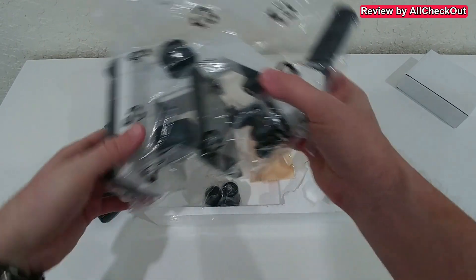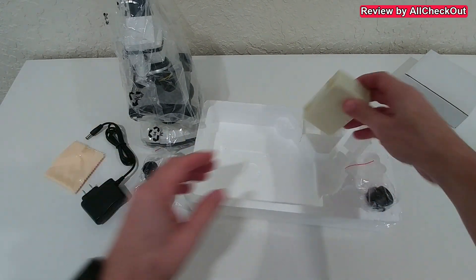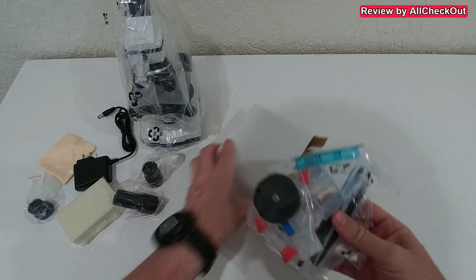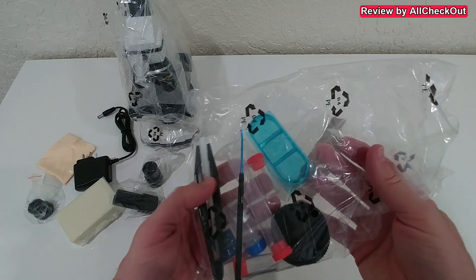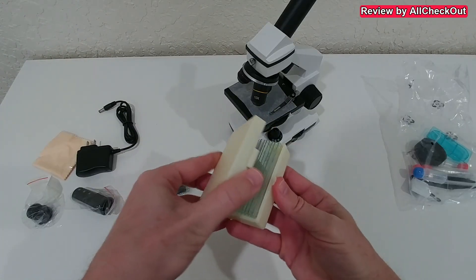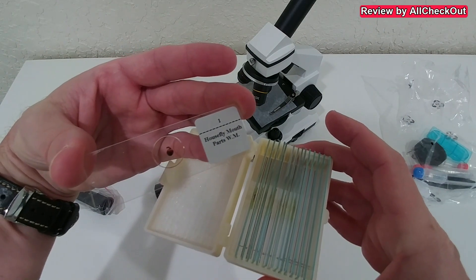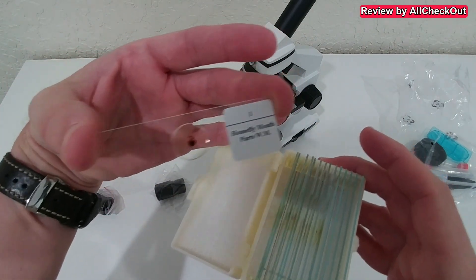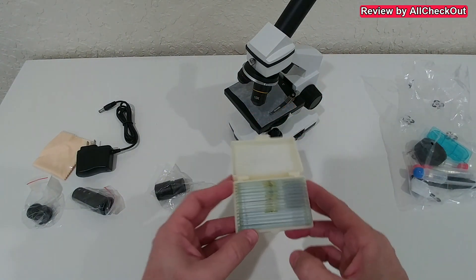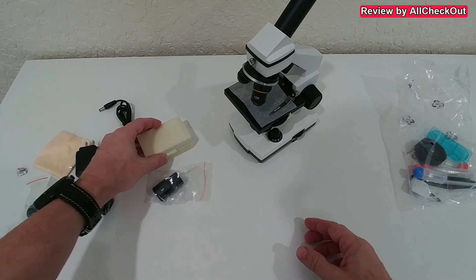Here we have the main part — it's heavy but not too heavy. We have some optical parts, a cleaning towel, a storage box for the optical parts, and some more parts. Here we have a lot of accessories for experiments. And here we have many glass plates for all the probes — we even have some pre-prepared samples, including a house fly and many more. Absolutely awesome — you can start right away without having to go outside.